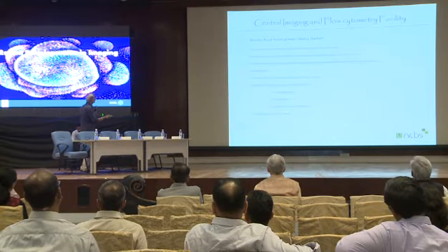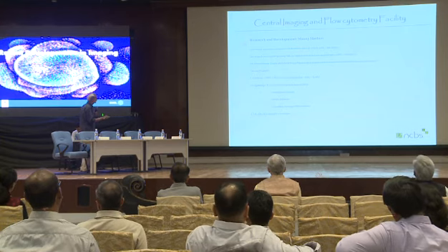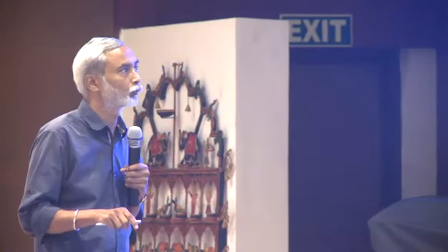So this is the R&D activity, and Manoj takes care of this. So we developed with Carl Zeiss the multimodal system in 2003, and Jito was involved in that project. And then Jito also developed two camera spinning disk confocal microscope to do the anisotropy measurements with Andor Technologies. And after that, Manoj has done a whole bunch of things. Unfortunately, I don't have time to go through each one of this.